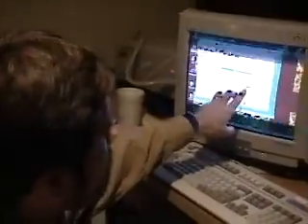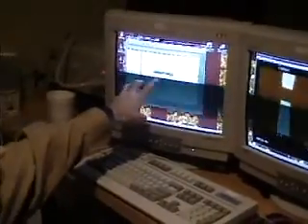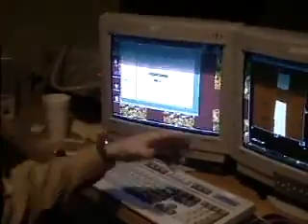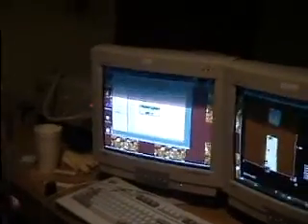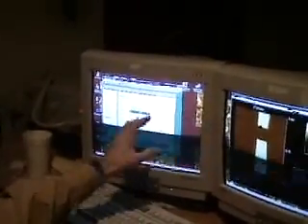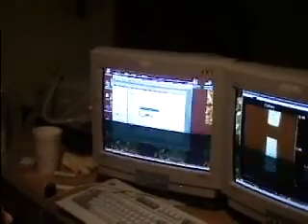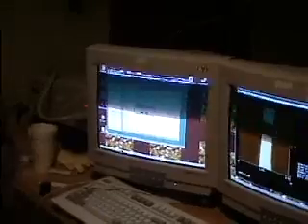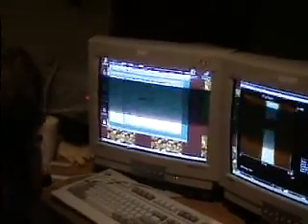When I quit out of the flatten, let's say if I try to open a new file, it's always going to give me this warning, current file has been modified, save it, because you've done a little bit of data manipulation with the flattening. Most of the time you want to pick no, because it's pretty quick to re-flatten, so it's not worth it to save it. But if you've done a lot of effort to draw boxes around many of these little high places, then you might want to take the time to save it.